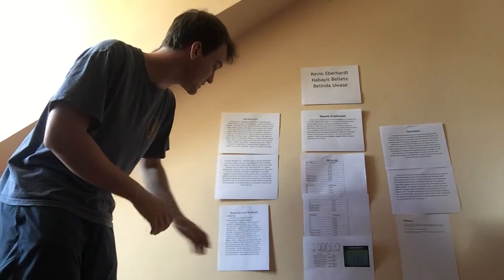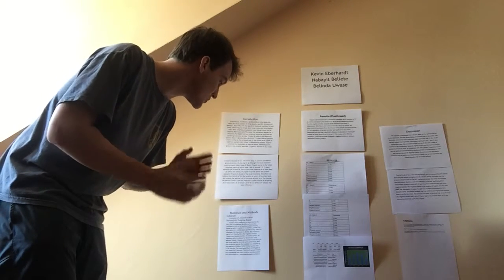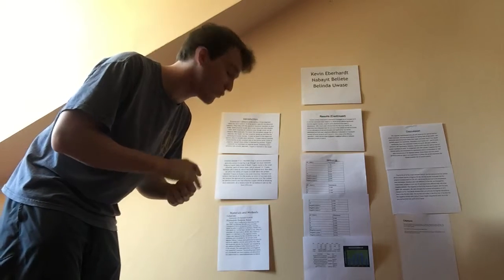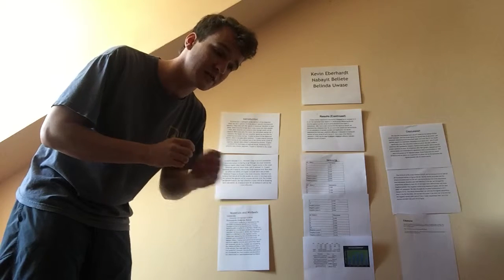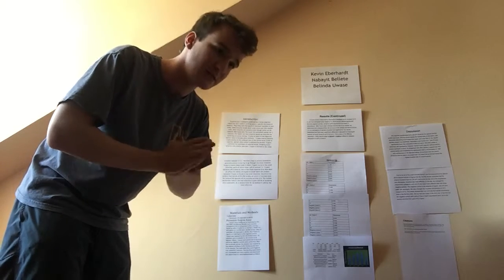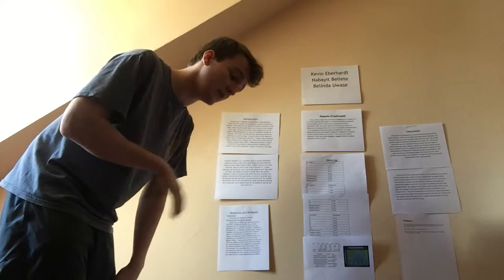In order to conduct this experiment, we had 450 microliters of reaction buffers. So these are the buffers that are varying our pH. What we did was we did 3 repeats for each pH level. So we did levels 6 through 10, and we did 3 reactions using the reaction buffers for pH 6, 7, 8, 9, and 10. In addition to that, we also had a negative control.